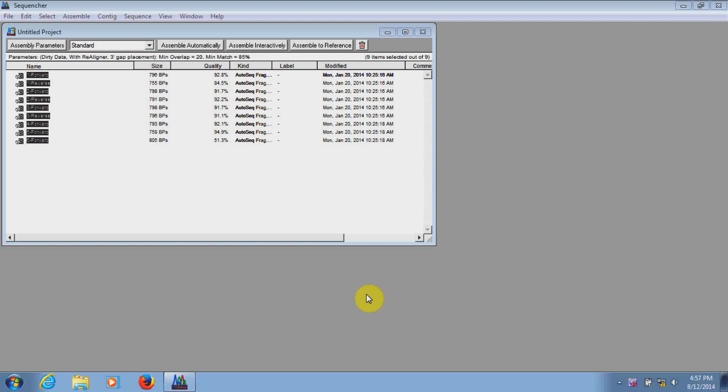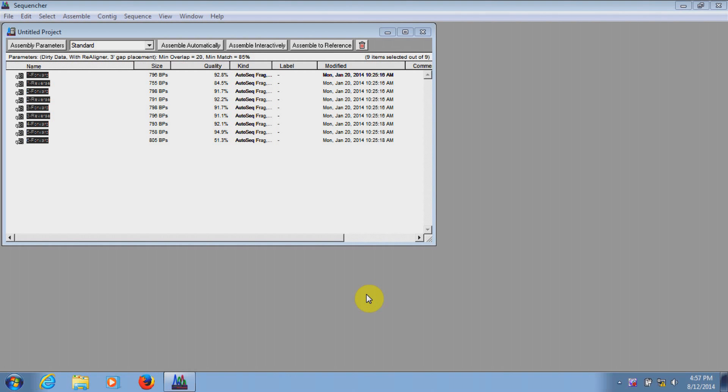Hi, this is Jason from GeneCodes Corporation. Today, we're going to look at how to trim low-quality data from sequences in Sequencher.